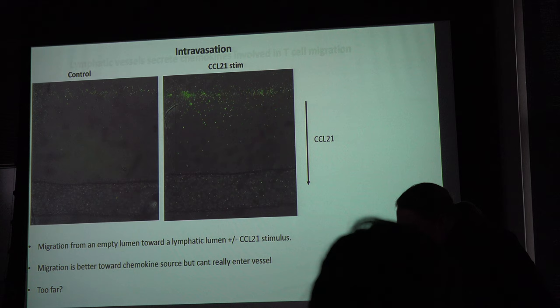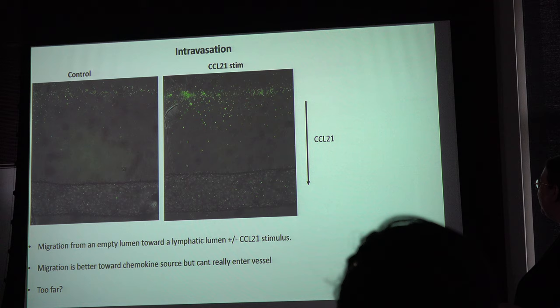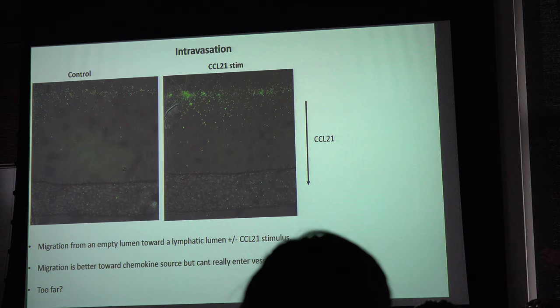So we first started trying to model the intravasation step. So the cells are entering into the lymphatic vessel, where they're going to flow towards the lymph node. So we've tried quite a few different things. So here we tried putting CCL21 inside the vessel, and they seem like they were able to sort of start migrating across. Unlike neutrophils, they're not highly migratory. It turns out they don't make proteases. So they can't actually kind of clip their way through the collagen. They have to sort of change their cytoskeleton and try and squeeze through. So we may run into some issues with the collagen density here.